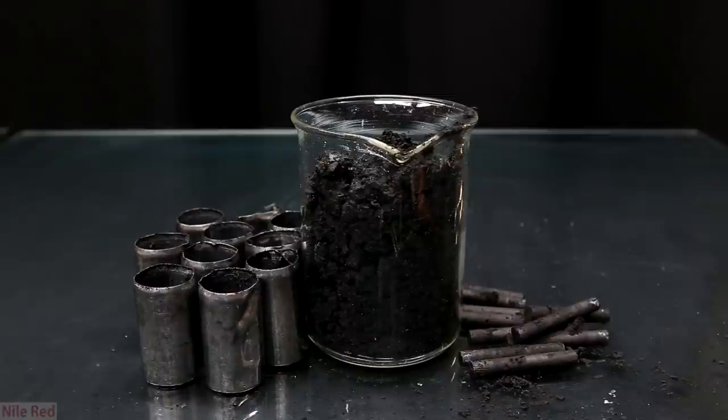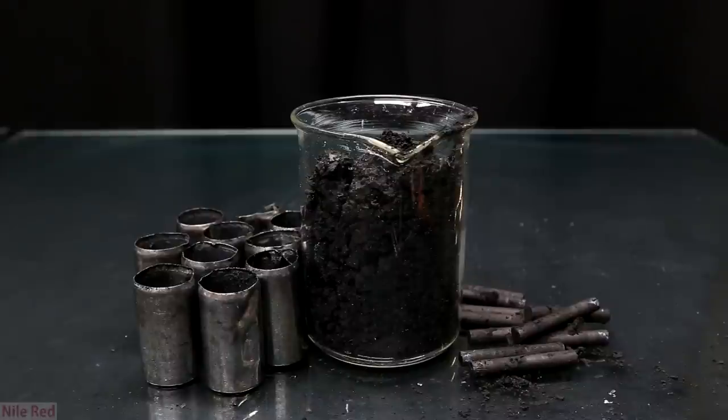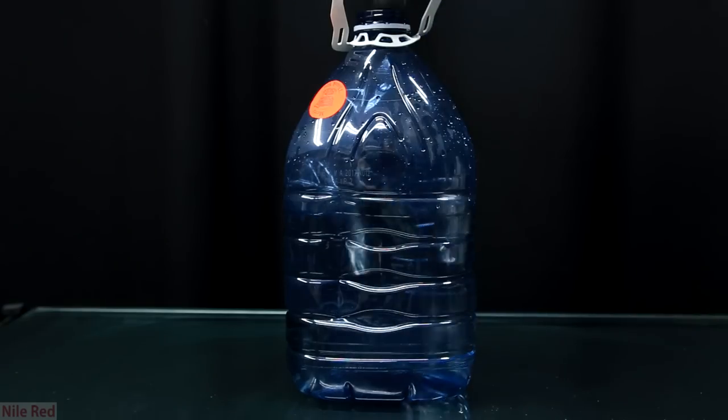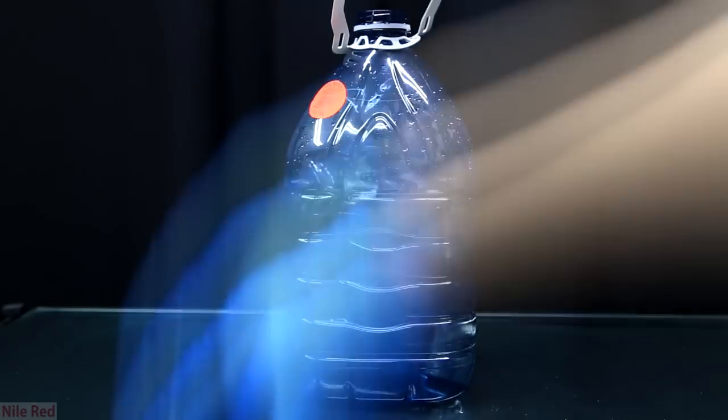So this is what all the manganese dioxide at the end looked like with all the carbon electrodes on the right and all the empty zinc cans on the left. To wash the cans and the electrodes I simply put them in a bucket of water and shook it a lot.